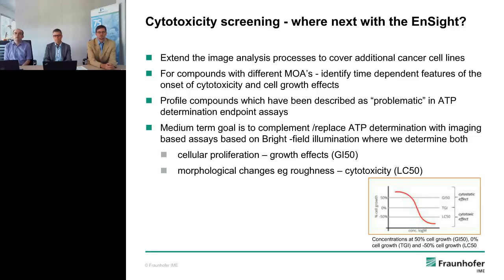Certainly we want to extend the image analysis methods to cover additional cancer cell lines, so we can screen against a larger panel and see how it is in terms of consistency compared to data in the compared database. So we want to be able to do that evaluation.